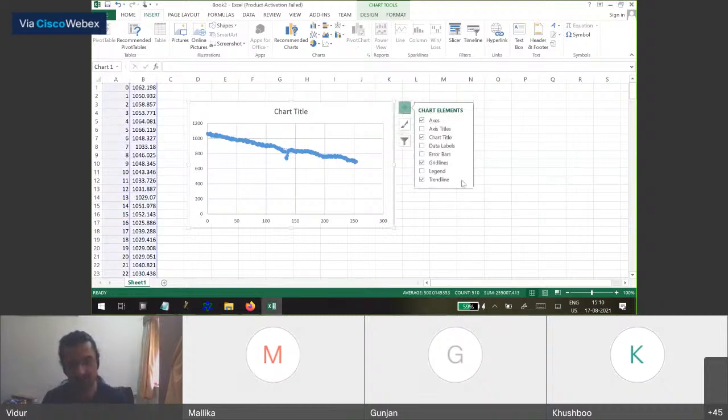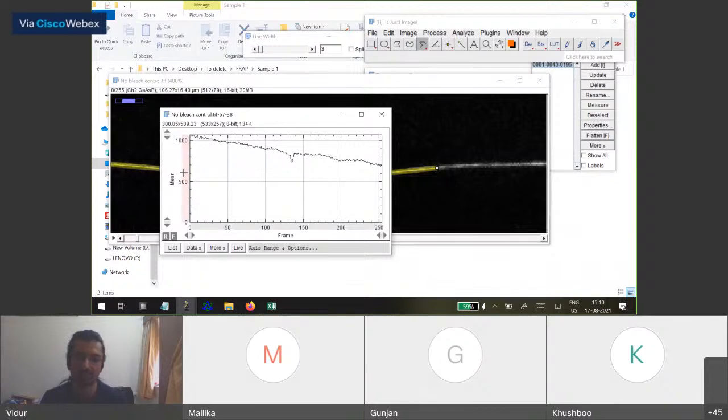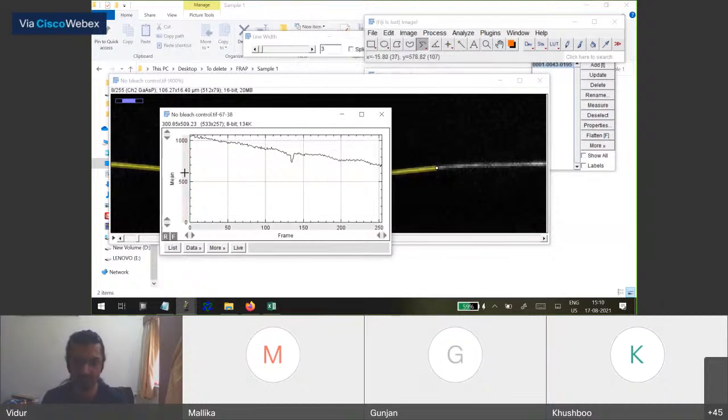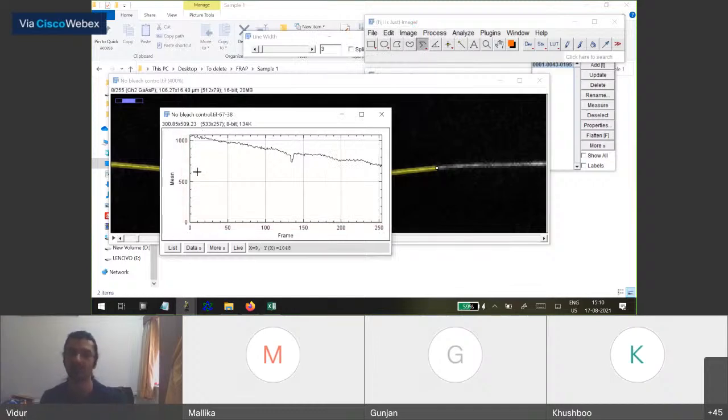Second, how did you change the values? Zero thing. Okay, 1 second. Here, what you do is you just double click on the y-axis. So if you just hover over the y-axis, you'll see that it'll brighten up to orange. You just double click it and you will see this column where you can rescale your plot to any number that you want. So here you can just type 0 and the maximum you can just let it be, because what we're interested in is how far this is from 0, how we normalize.